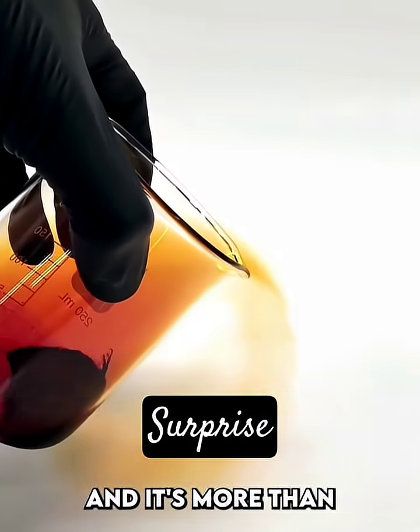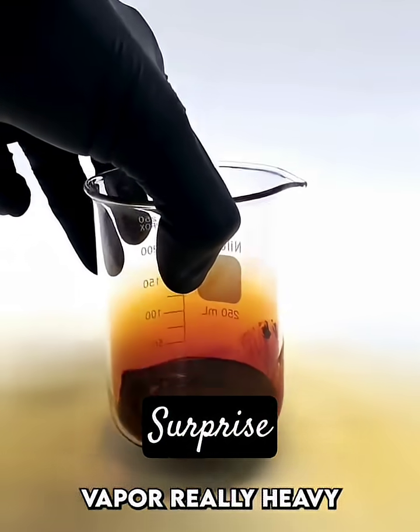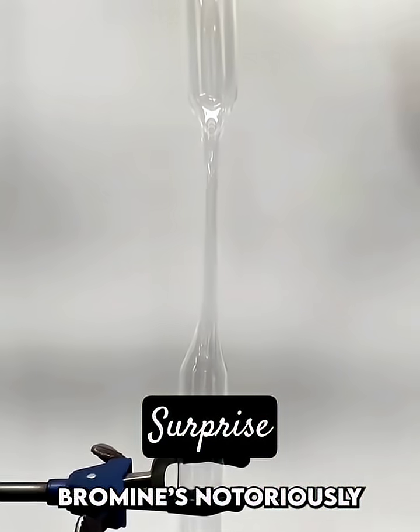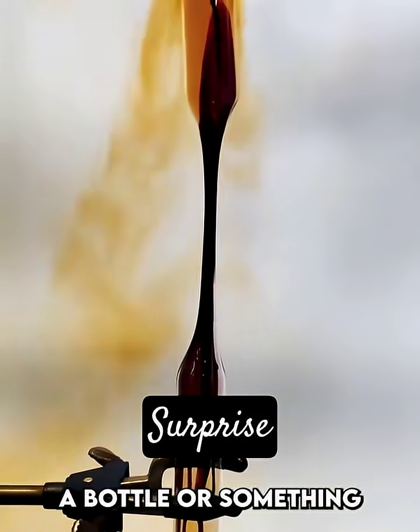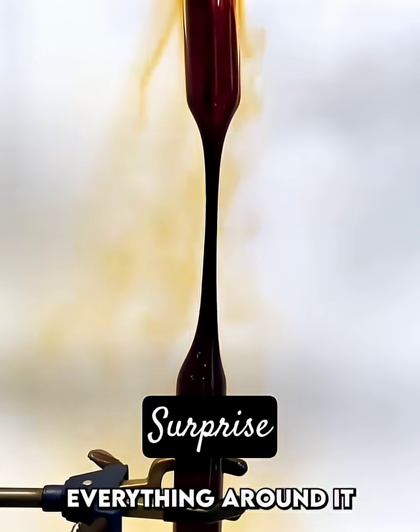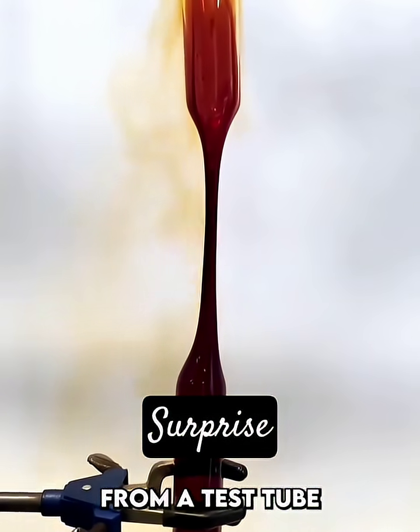Bromine's really dense — it's more than three times as dense as water — and this makes its vapor really heavy. Bromine's notoriously difficult to store, and if I just put it all back into a bottle or something, it would damage everything around it. So I have to seal it again in a glass ampoule that I made from a test tube.